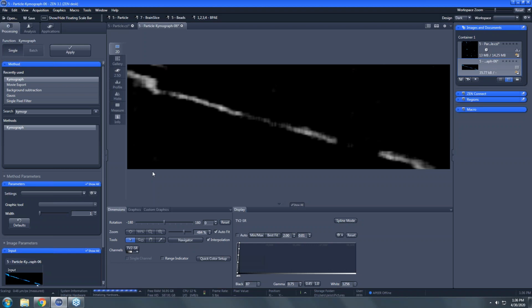And then we're marching through those time points. And so we're seeing the displacement of the particle along the trace. We see the particle disappears at some point, which I think is just maybe our tracing wasn't exactly on, but Nicole did a great job, and we can pull the angle off of this. Because the angle will give us displacement over time.